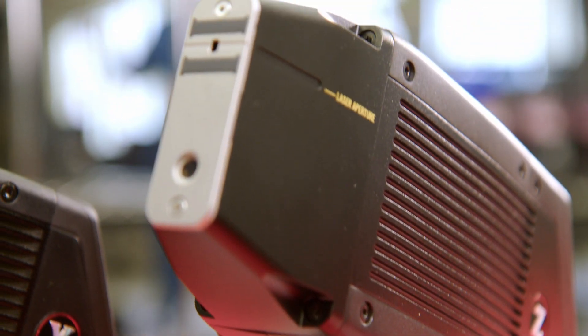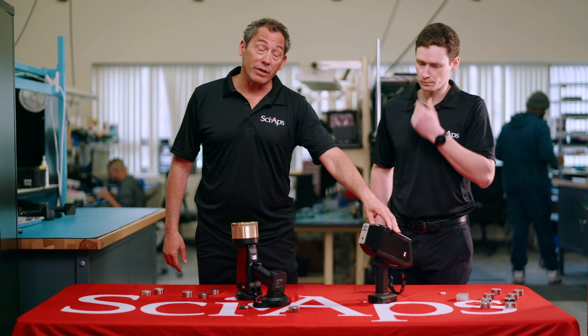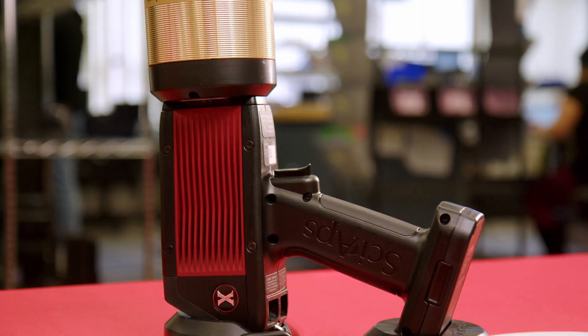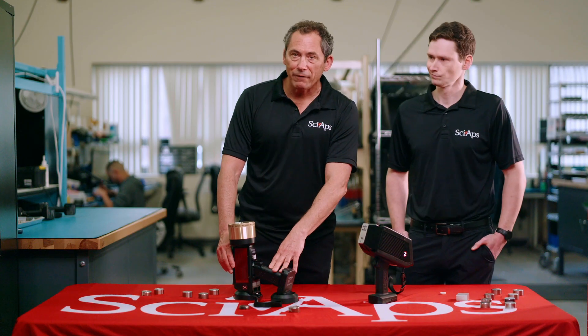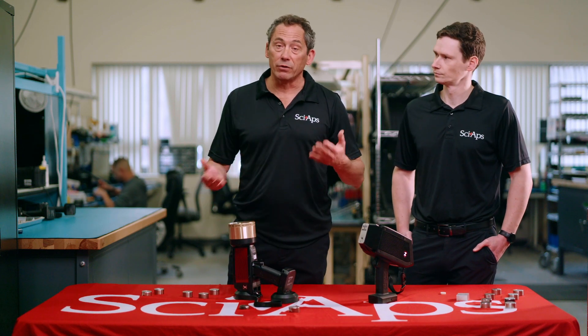The first one is our LIBS unit, set up to measure lithium in rocks and actually in brines as well, which we'll talk about later. The second analyzer is a state-of-the-art XRF — our model X555 — and what's unique about it is it's the only handheld that uses a 55 kilovolt tube.